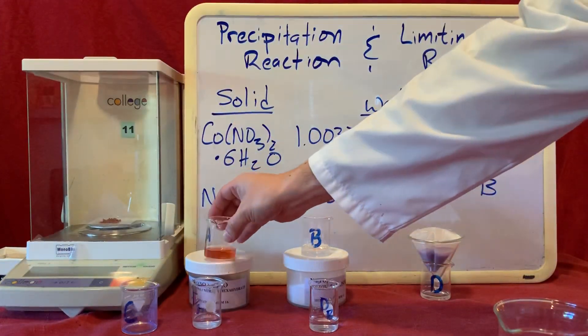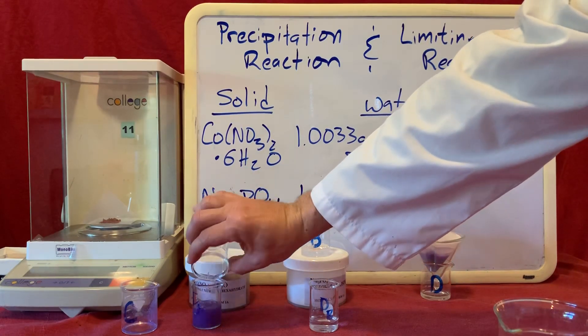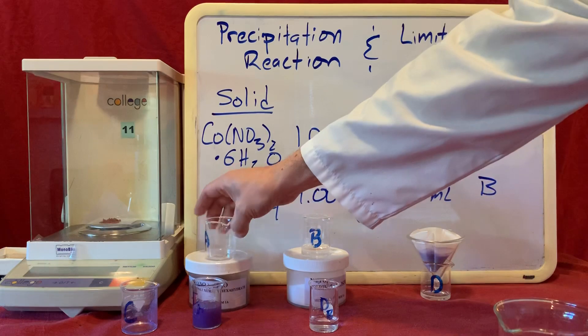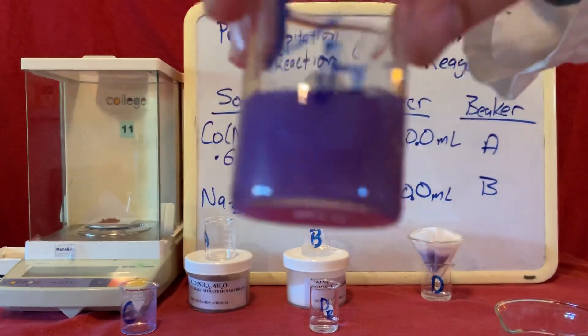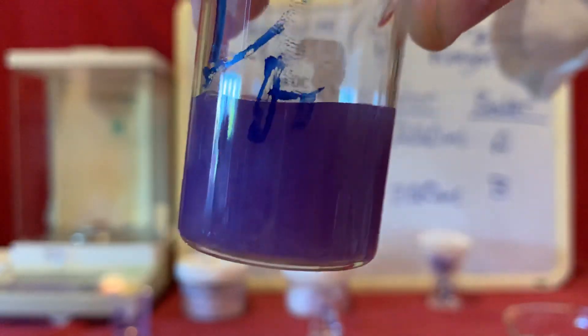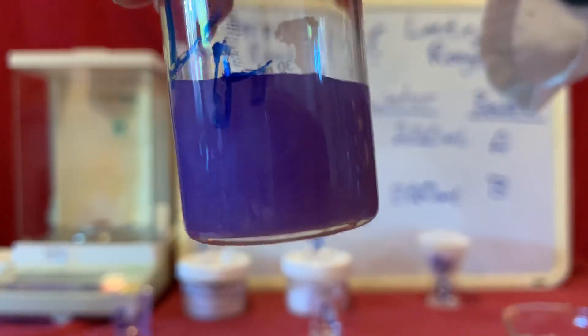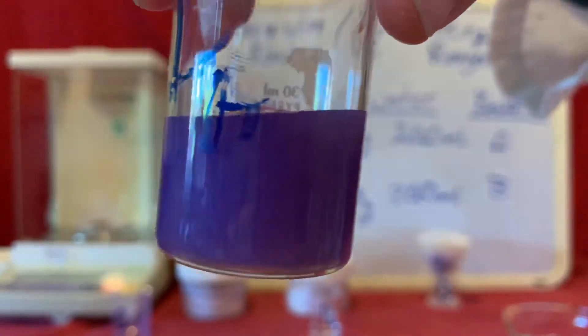Here's solution A. Let's add that to D sub A. We can see our result. When I added solution A to our supernatant, the contents of beaker D.